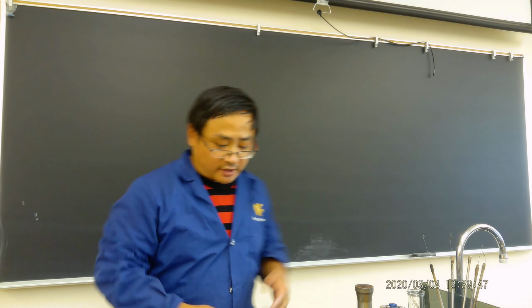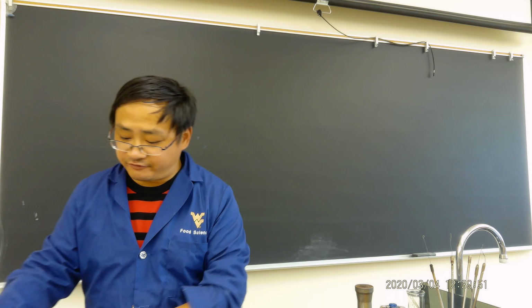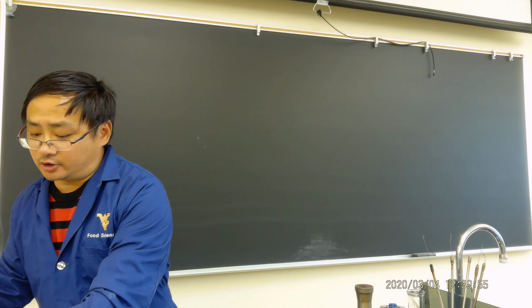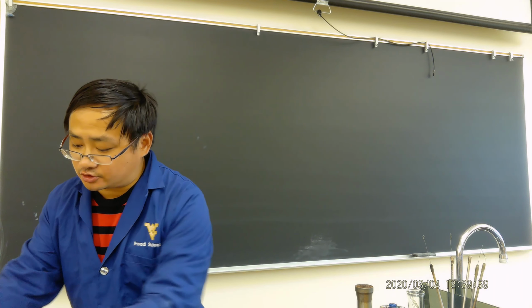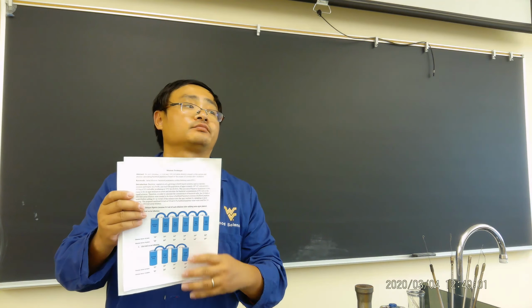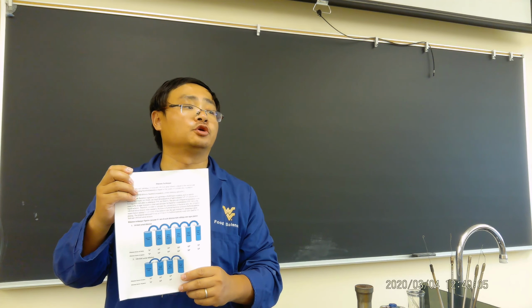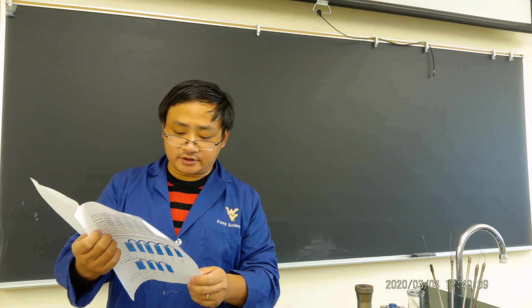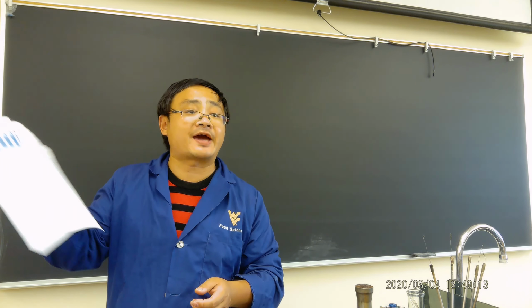Okay, so let's just have a class, and everybody will be receiving 3 fact sheets, and we're going to do 3 jobs, but it won't take too long today. First of all, you're going to have the fact sheet called dilution technique. I have listed all the diagrams for you showing how we do the dilution, and there is a quiz, the take-home practice questions, at the back.